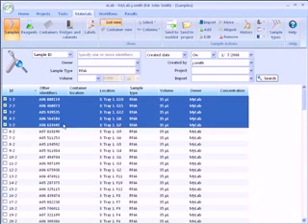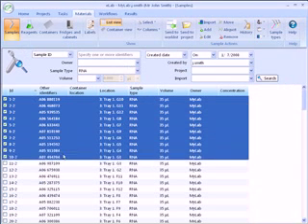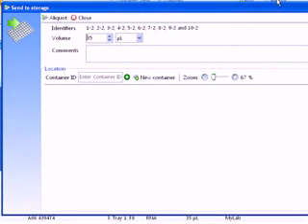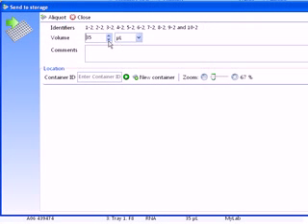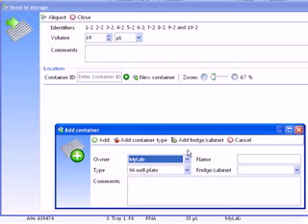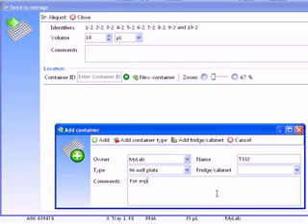To aliquot one or more samples to another location, use the aliquot button. Here we are aliquoting 10 microliters of RNA to a new container for export to another lab.